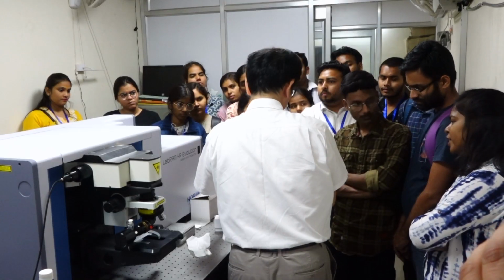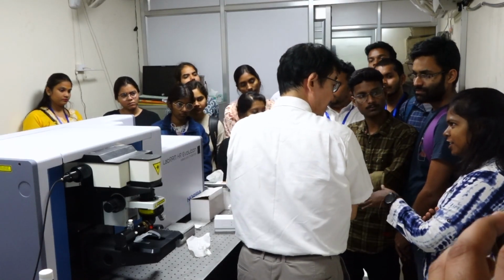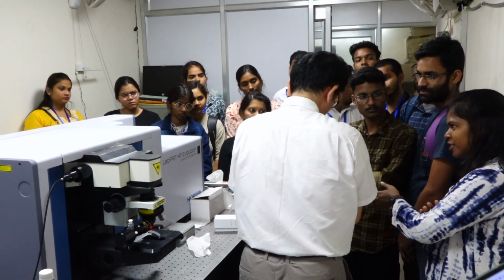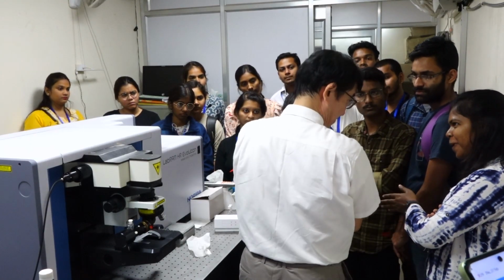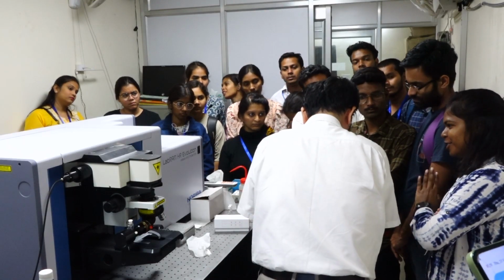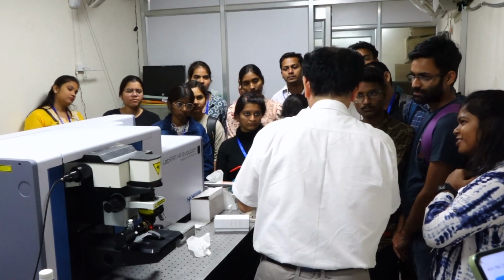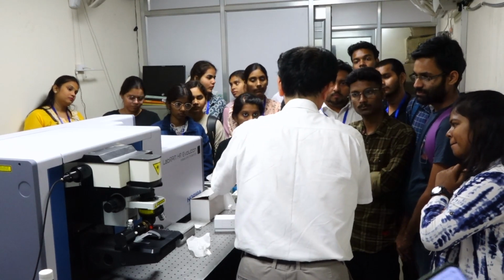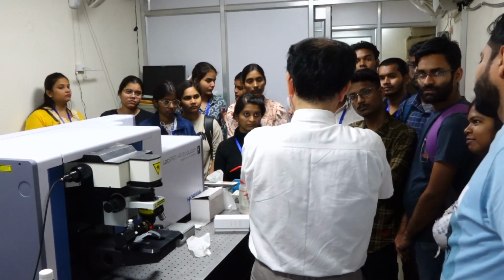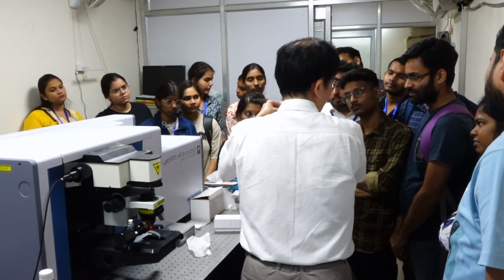Some amount of light must be lost in other directions. The scattered light in other directions, except 90 degrees, is getting lost now. Right? So that will decrease the intensity of the Raman signal. What is the difference in the intensity of the Raman signal between the two configurations? In principle, it's the same as far as the numerical aperture is the same.